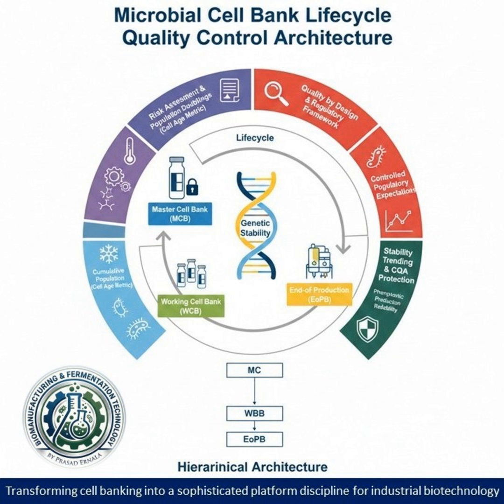No drift allowed. And those are controlled by critical process parameters, the CPPs. Yeah. And this is during the banking process itself. We're talking about the specific cell age when you freeze, the exact cooling rate, and of course, the long-term storage temperature. So, if I'm getting this right, the entire system is designed to guarantee that a tiny vial, thawed maybe years from now, will seed a full-scale campaign that performs identically to a run started today. That is the enormous constraint, yeah.